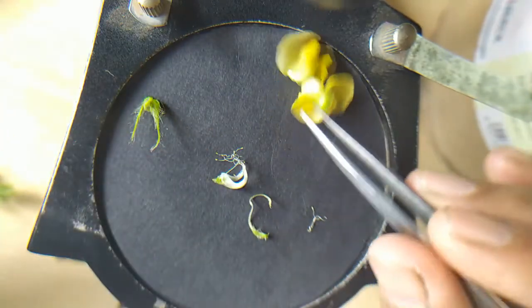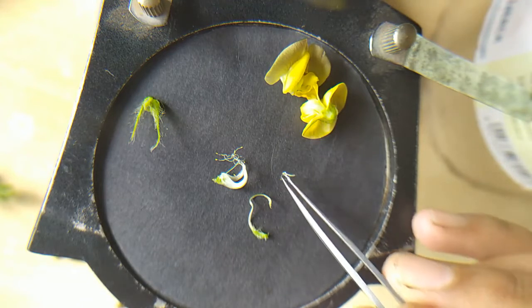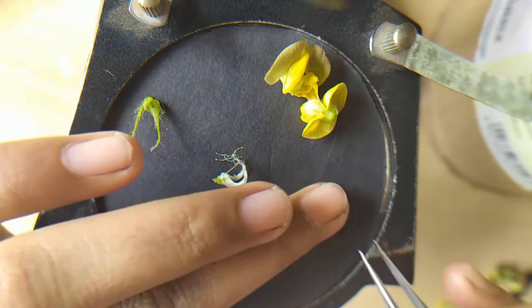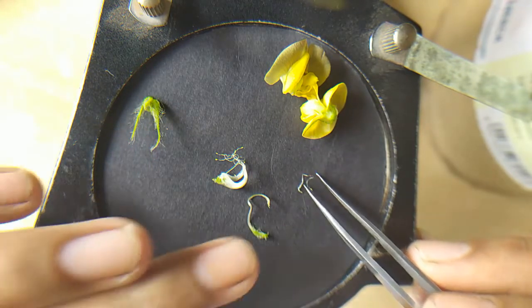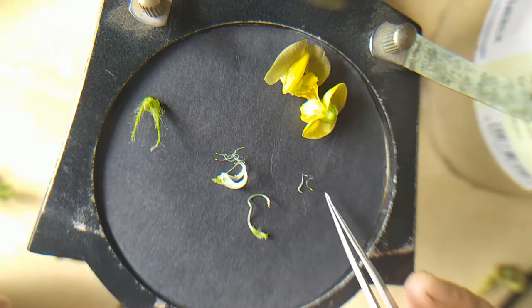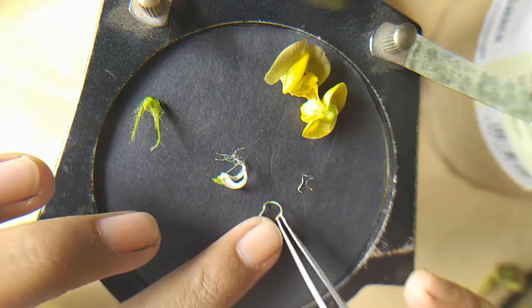So you should understand the condition in case of urad bean. This is the flower which I have dissected here. This is the flower of urad bean, and the condition of anthers is 9+1, so it is the diadelphous condition, and this is the gynoecium.